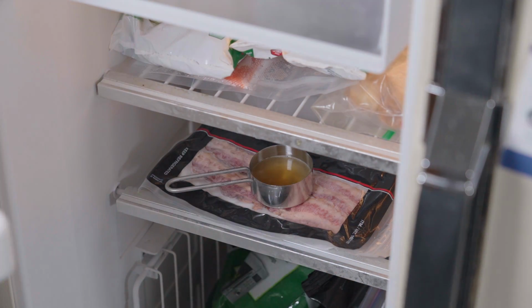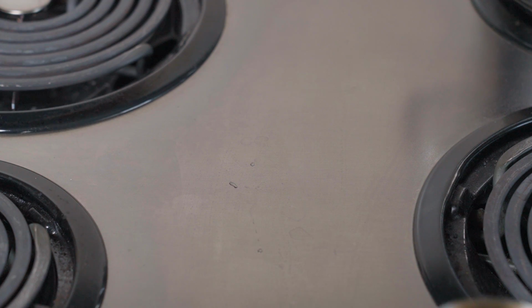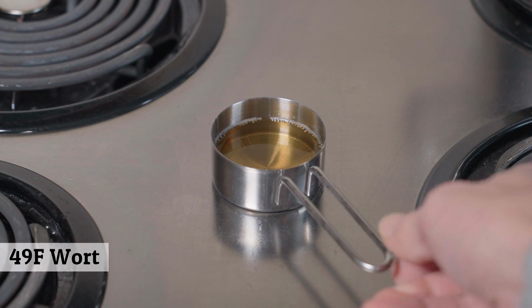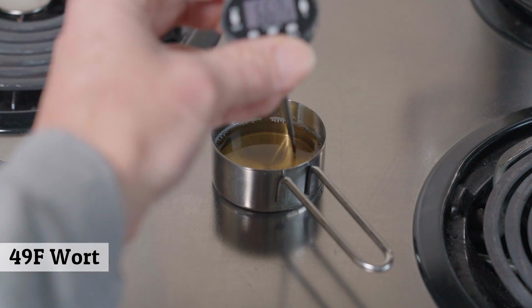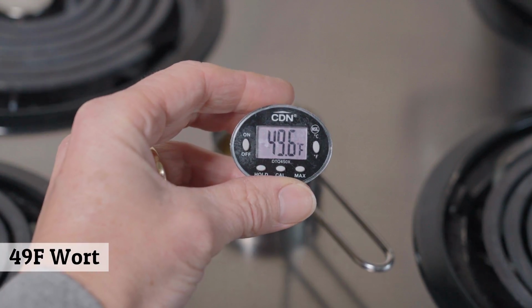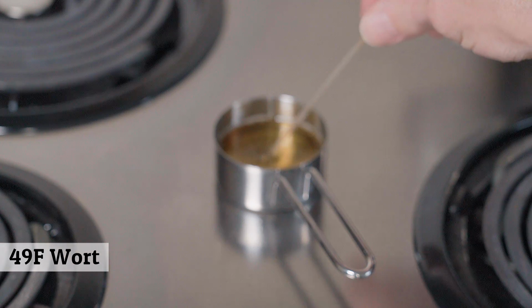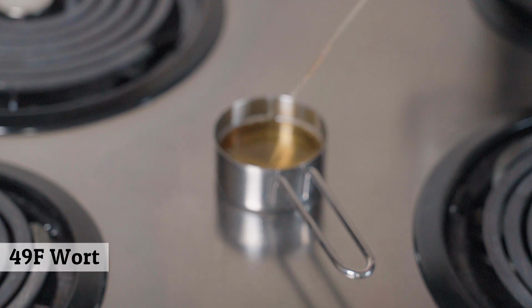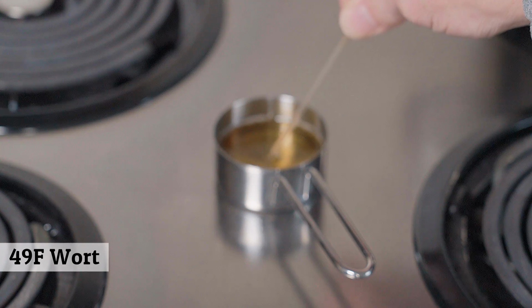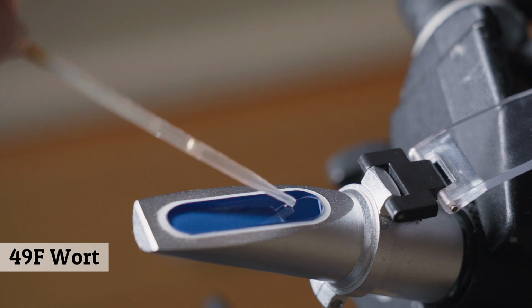Our last sample for today will be coming out of the freezer to be chilled. And this sort of represents a post-boiled, post-chilling wort sample that you might take. And this might be for a lager beer. So I did it around high 40s Fahrenheit. And sorry, I forgot to adjust focus here. I use manual focus on my camera, so just have to chalk that one up.